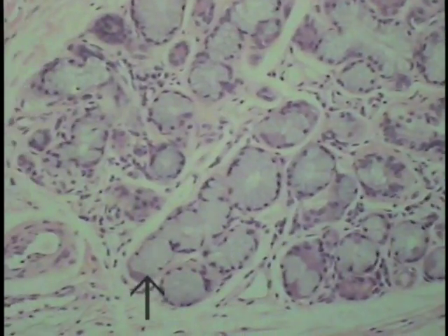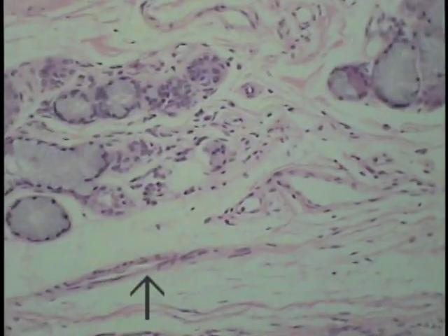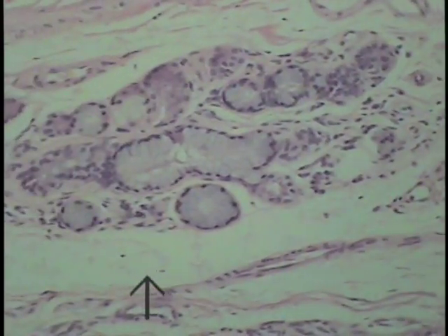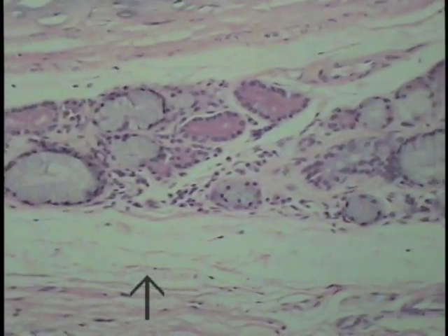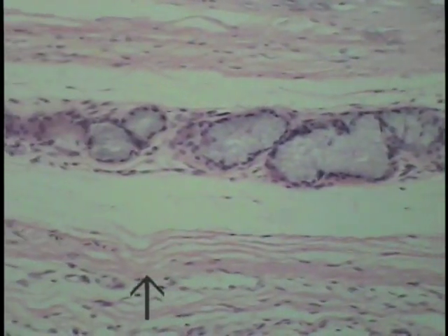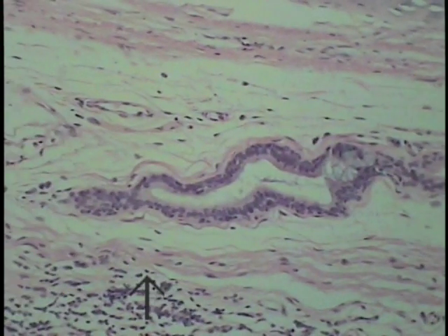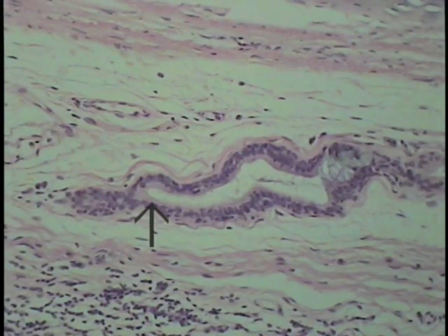So these are tracheal glands, mixed glands, that lie in the connective tissue substratum beneath the epithelium. Some authors like to, as I mentioned previously, place these in a submucosa and try to make a similarity with the gastrointestinal tract, but that subdivision is very difficult to see oftentimes in various sections of the trachea. I'm just coursing along that gland that we observed previously, and finally it ends into a duct that's going to conduct secretory materials to the surface of this particular organ.